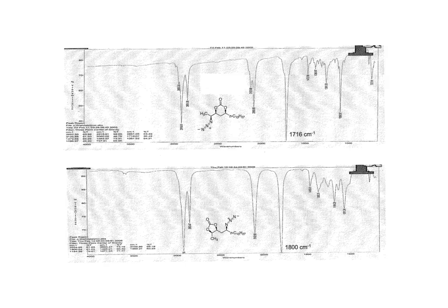I will conclude this video on infrared spectroscopy with an example from my own laboratory from a number of years ago. We synthesized the 6-membered ring carbonate, and in the infrared spectrum, this gave a stretch at 1716 wave numbers. By the way, there's also an azide stretch that's evident around 2100 wave numbers. We prepared this compound from the secondary alcohol formation of a mesylate in displacement with sodium azide.